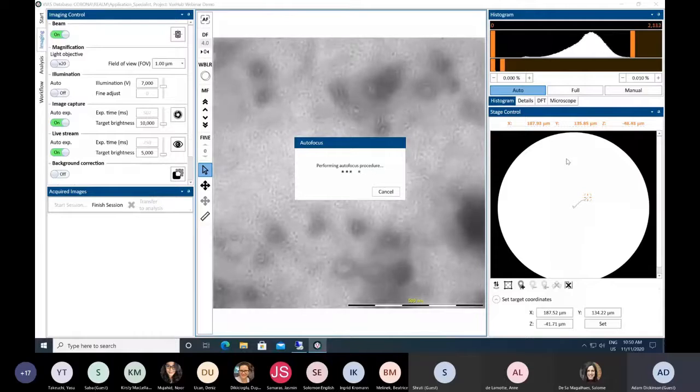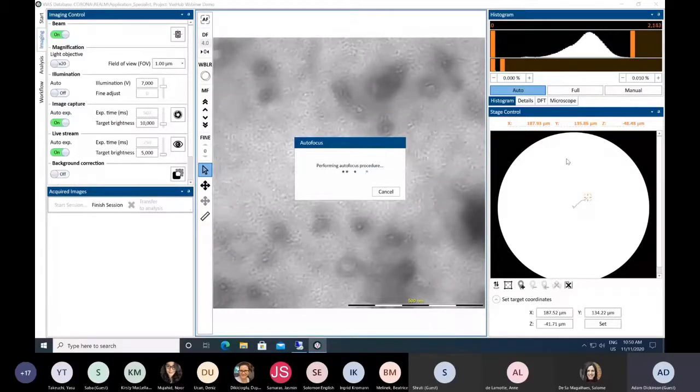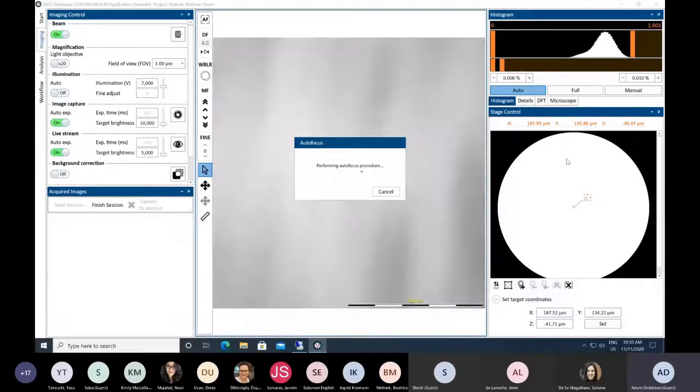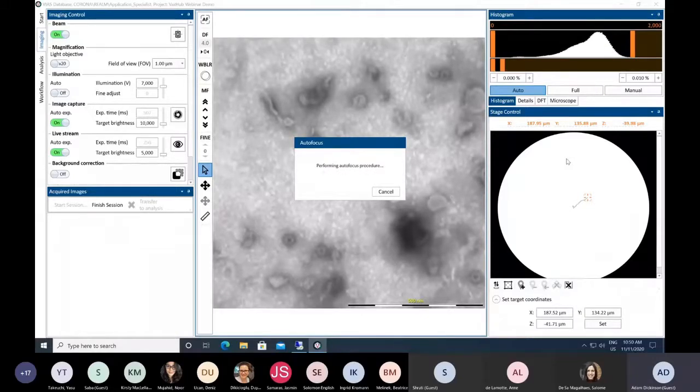So it's best to use an autofocus tool, and then every time you move to a new position, you can get an optimal focus. My plan today is to set at least 3 to 4 different regions or waypoints. I'm going to be applying autofocus, and hopefully we can acquire somewhere in the region of 40 images to give us a nice representation of what's occurring on the sample.